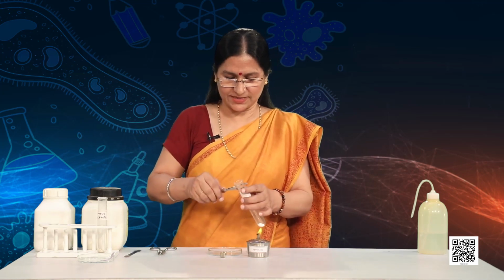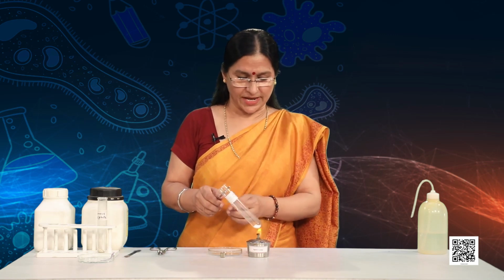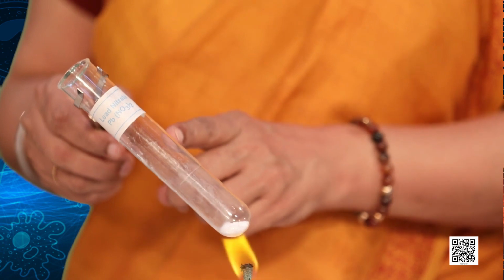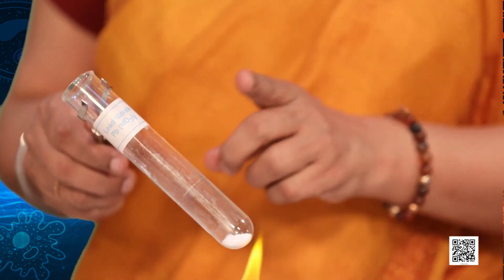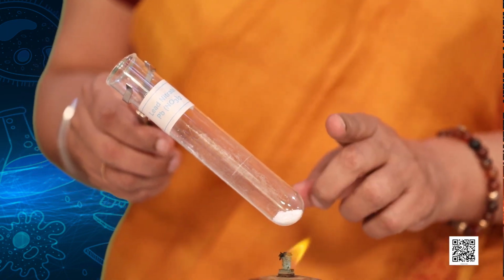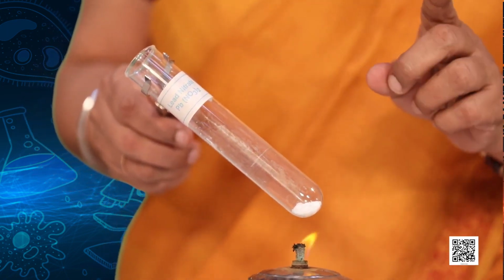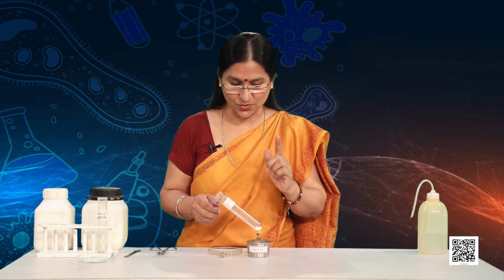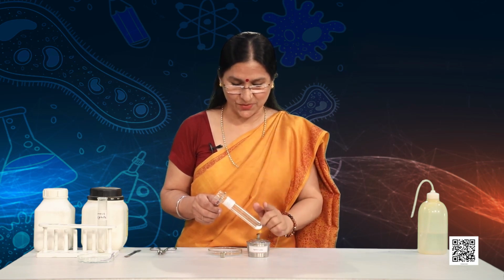I am holding this tightly with the test tube holder and I will be heating it. Again, keep it at an angle of 45 degrees. And yes, note the color of the lead nitrate, because slowly there is going to be a change. This is what the magical world of science is about. Again, I can hear a crackling sound. That means the reactant has started breaking down.